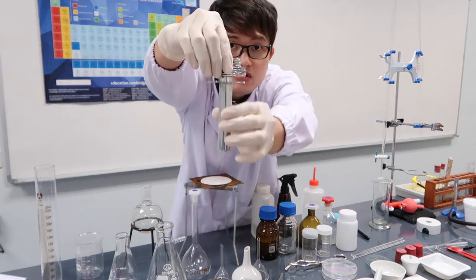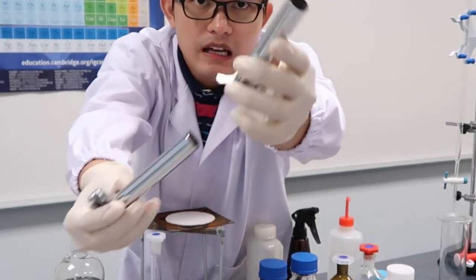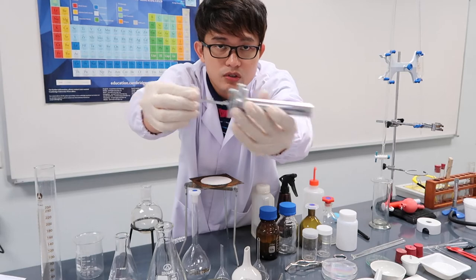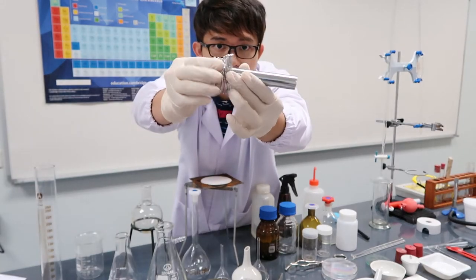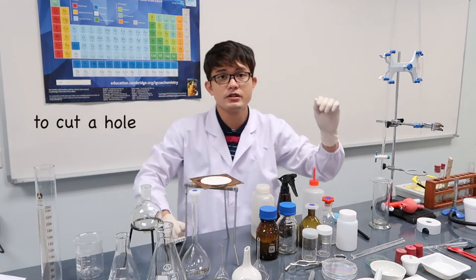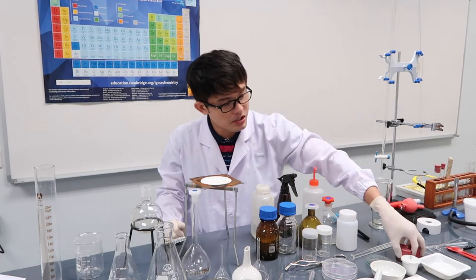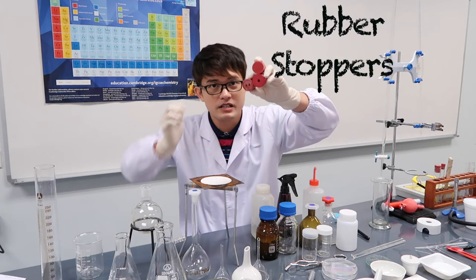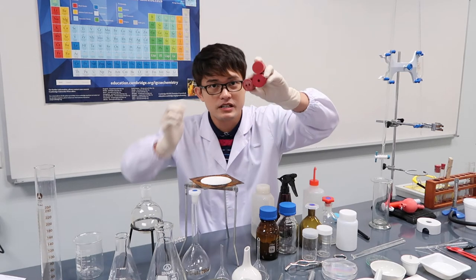So these are cork borers in different sizes — this is the biggest, and this is the smallest. Cork borers are used for making holes in rubber stoppers. Speaking of rubber stoppers, here are some samples.